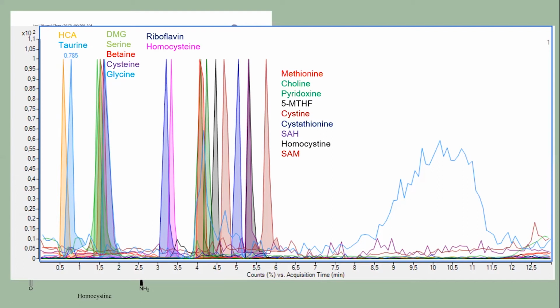So here it is clear that there might not be sufficient ionization. And in this chromatogram, I scaled the chromatogram to show a more comprehensive visual of chromatographic separation.